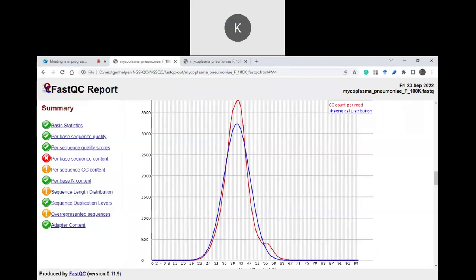So when you will be doing normal Illumina, during the Phred score and all the quality parameters, since it is high GC content, it will be removed. It will be in separate data sets. So you will be getting the CDS there, okay? CDS or ORFs we can say.